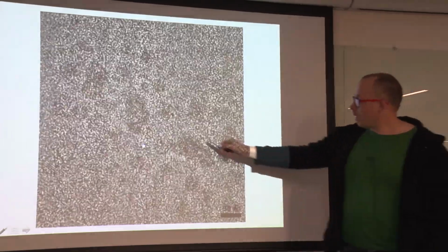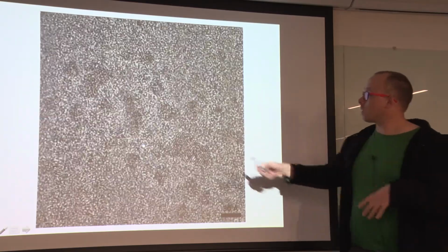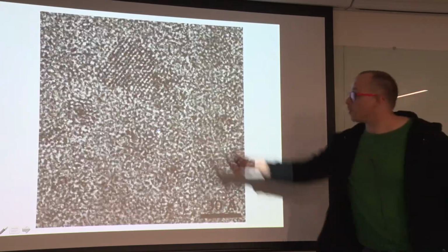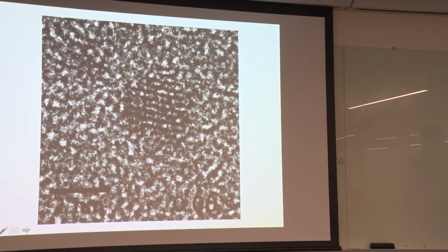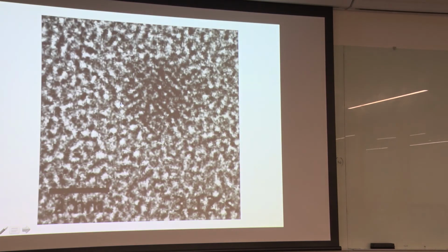And these big ones tend to dwell along a single zone axis, whereas the smaller ones are rotating very rapidly. I'll just focus in. You see the big ones tend to stay pretty much still, whereas the small ones are spinning around. And just to give you a better idea, I slowed down the process where you see these nanocrystals displaying different views to the electron beam.